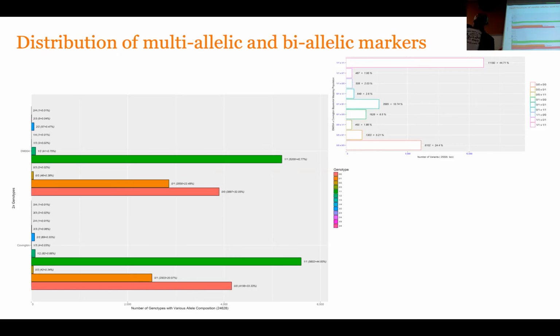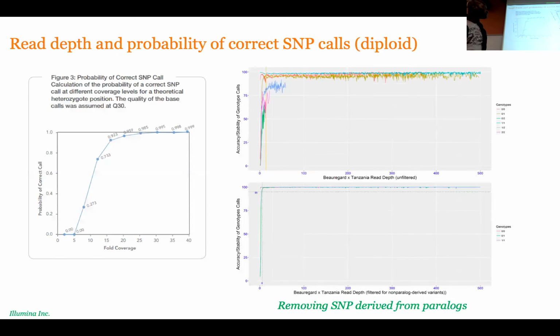And what you do normally for most genetic analysis, it's easier to work with biallelic markers. So typically people just filter all this out. Not because they are minor, but because sometimes it's difficult to work with multi-allelic state markers, right? So people tend to remove it. And then you end up with something like that on the right, where you're just seeing the 0 allelic state, which is the reference, and the 1, which is the alternate. And most of your SNPs should fall into that.